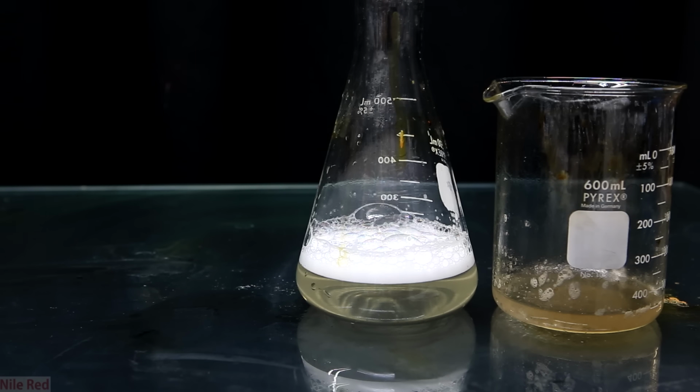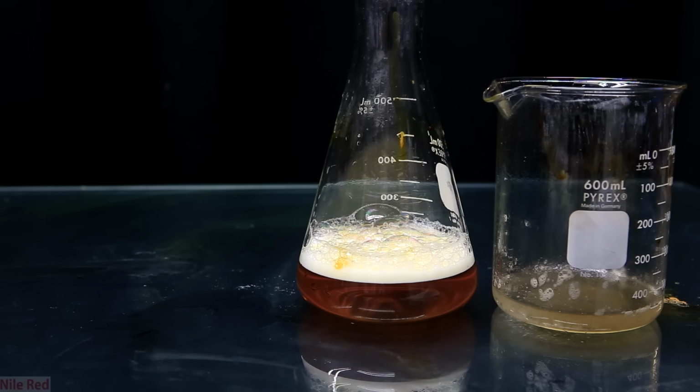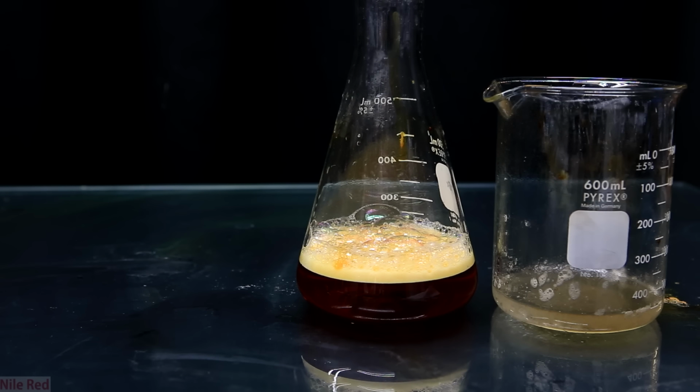I was actually able to add the thiosulfate solution several times, have it convert back to colorless, and then let it sit, and it would slowly become colored again. I said that I didn't expect this to happen and that I probably should have, because I coincidentally made a pseudo-iodine clock reaction. There are a few ways to make the iodine clock reaction, and in this case, this is the hydrogen peroxide variation and the only thing missing is starch. I thought that this was just an interesting coincidence that I happened to use sodium thiosulfate, and I thought that you guys might find this interesting.